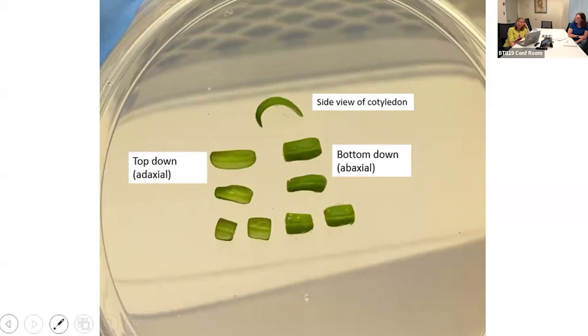What he's referring to is that here at BTI, there is a group looking at a Rio Grande line, and it was called PTOR, and that was a more difficult one to transform in the beginning, but we kept at it and we worked out different parameters and we got it to work. Maybe not as well as M82, but we were able to get it better than what it was initially.